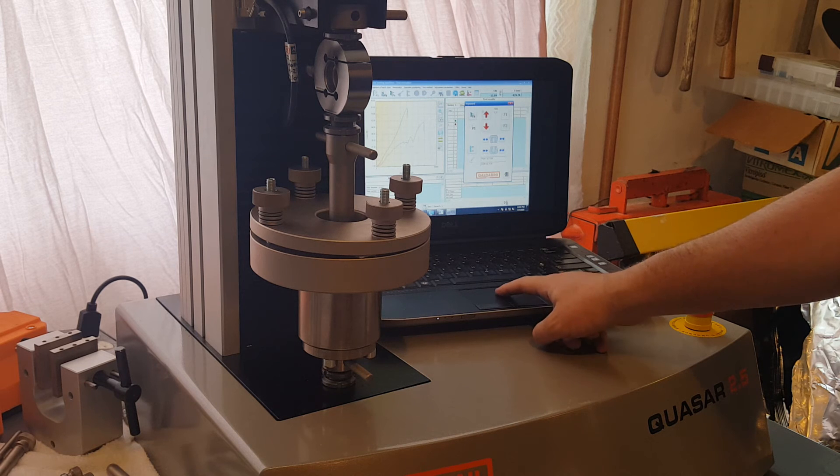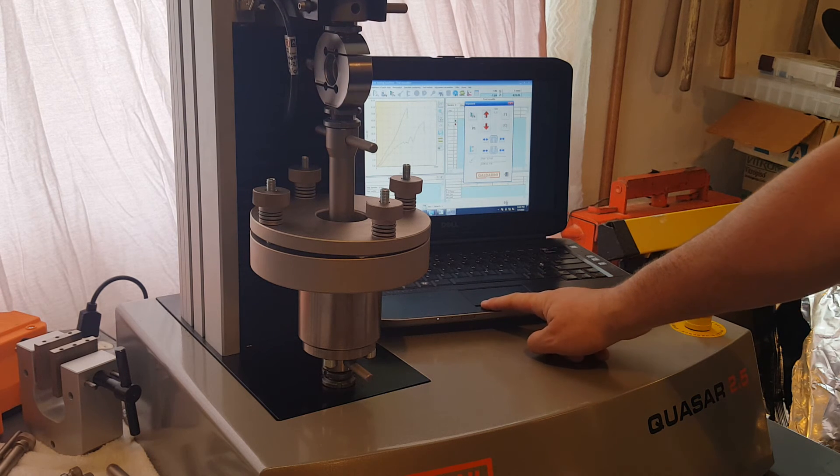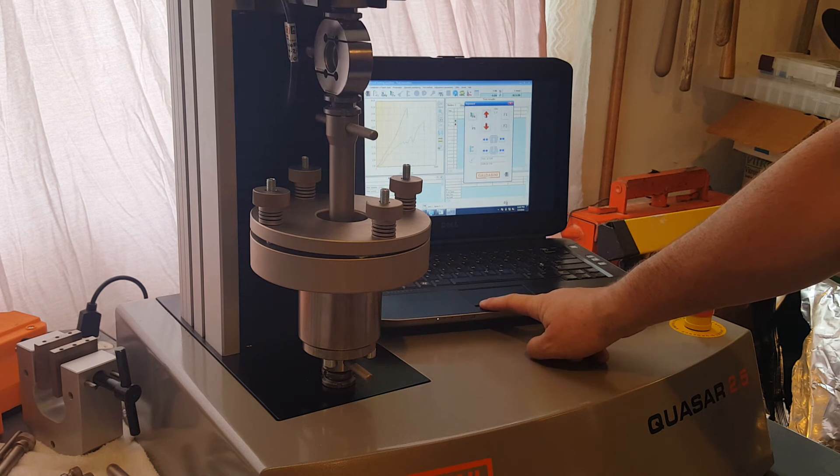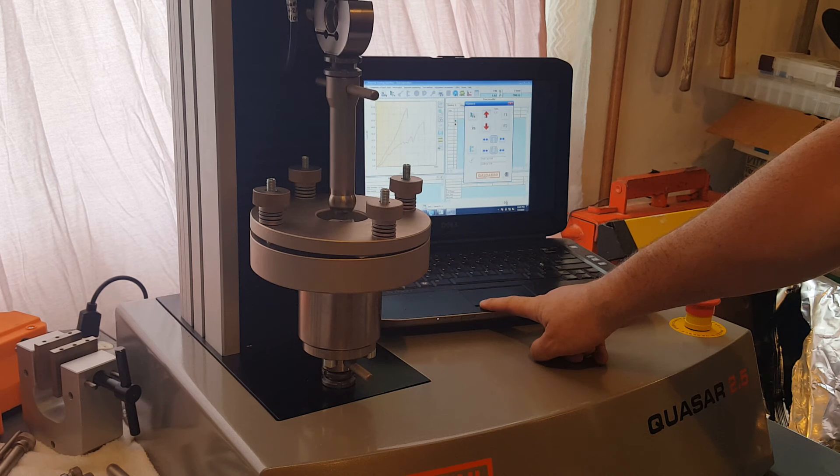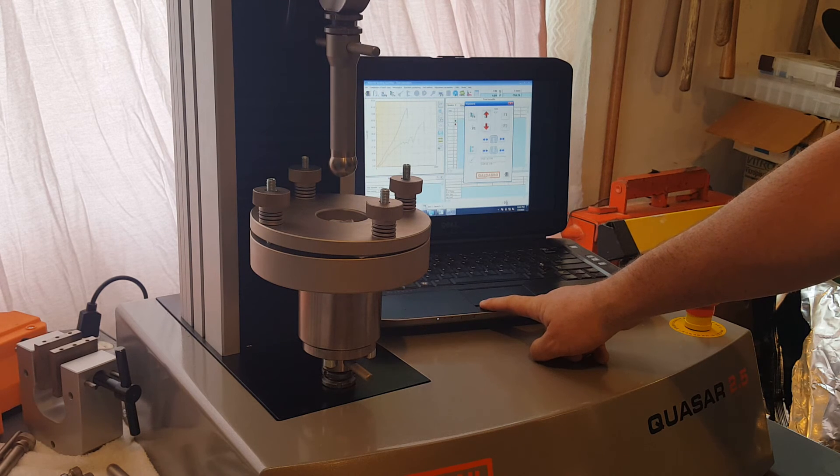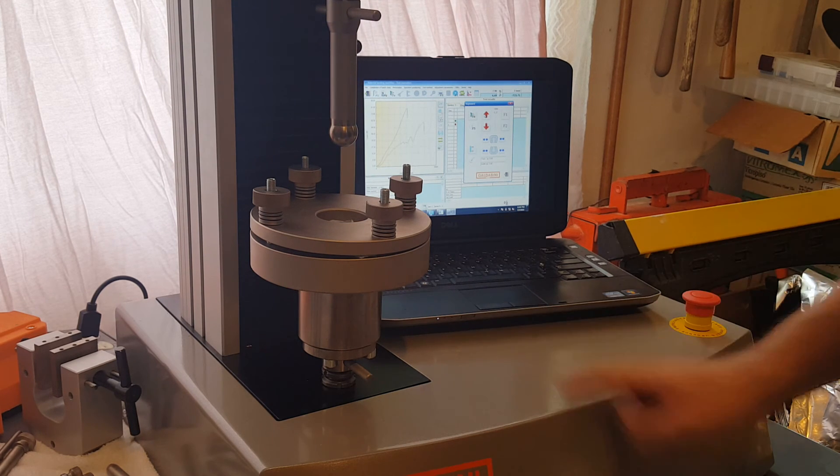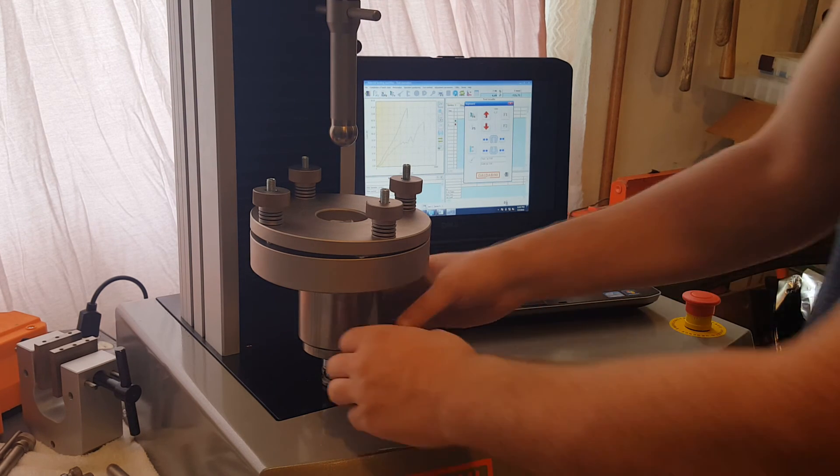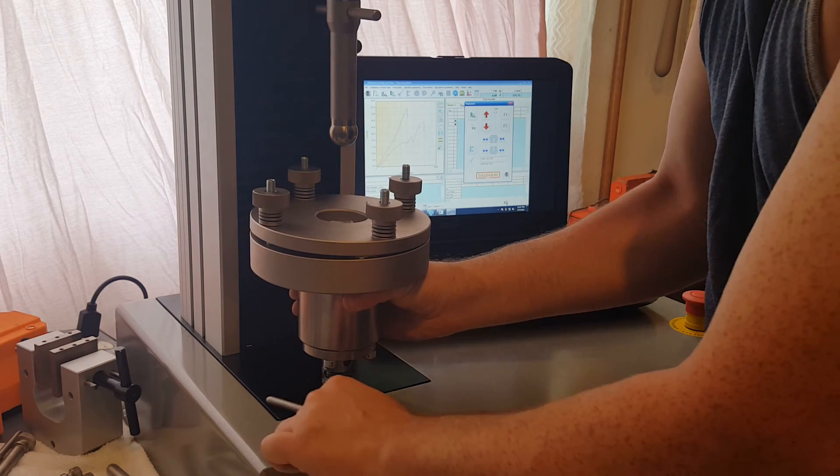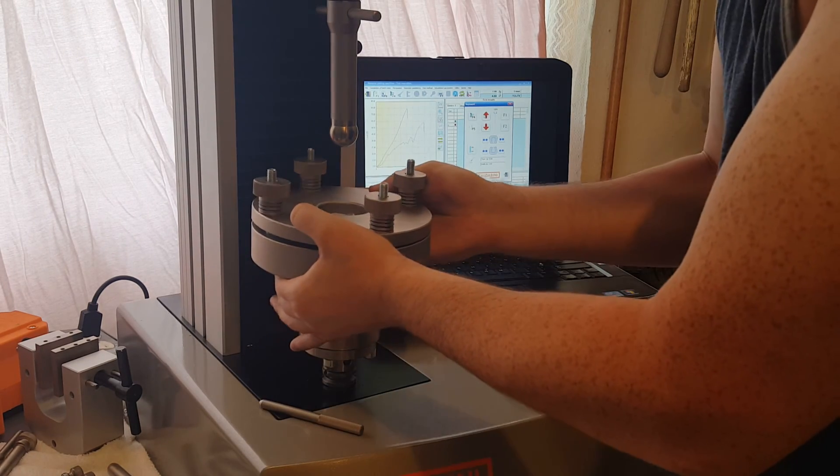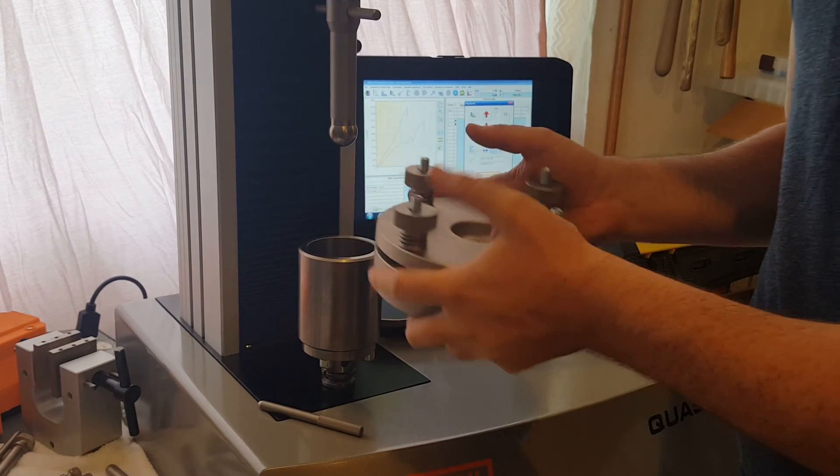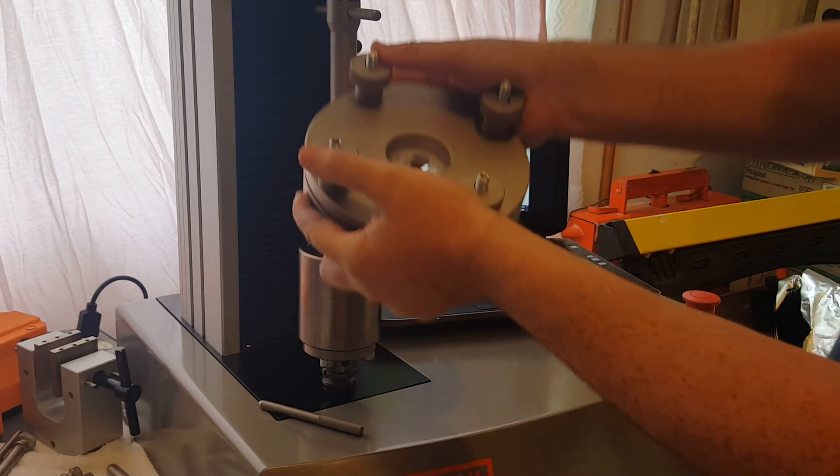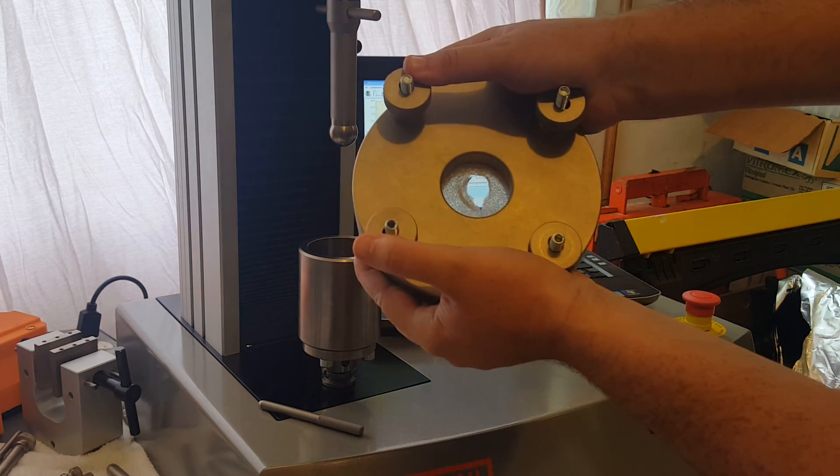Now the system is going to return to home after the test. There we go. I'll take this off to show you the results. There's the puncture right there.